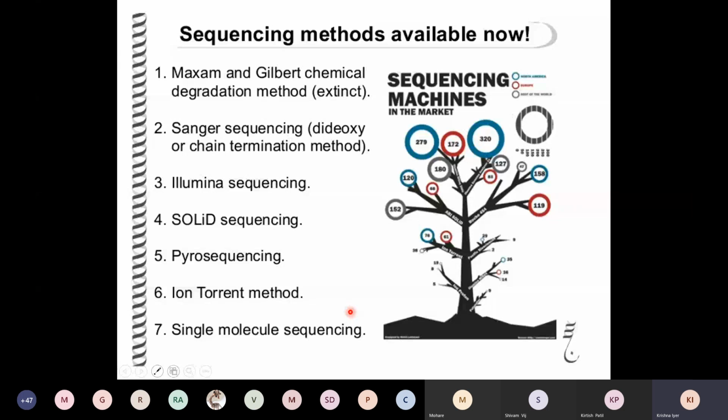And it has made sequencing very routine. At one time, sequencing itself used to be a big experiment that you did, but now it is something which people do on the side. Like in our chemistry lab, if melting point was automated, how nice it would be.